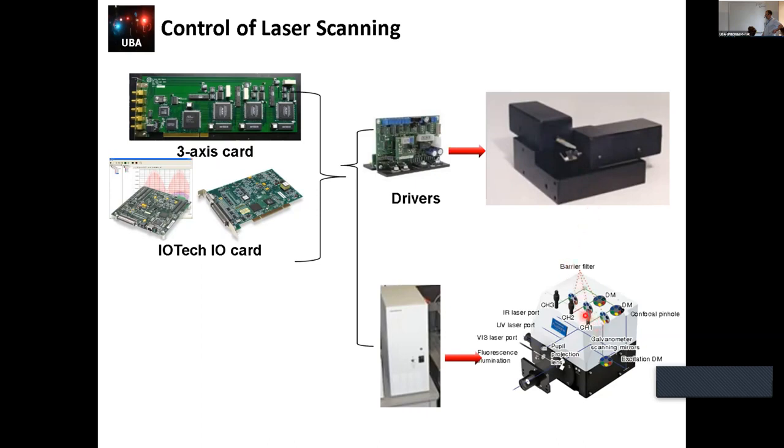Most of the brands use this same configuration, and often we have only point detection, line detection, or different ranges of squares or rectangles. In our setup, we can move our scanner as we want. We can even do circular scans, or any kind of shape. And this will be very important for the object tracking on Wednesday. Enrico will explain a little bit more on that, because we can do whatever function we want and provide the information to the scanner to do this.